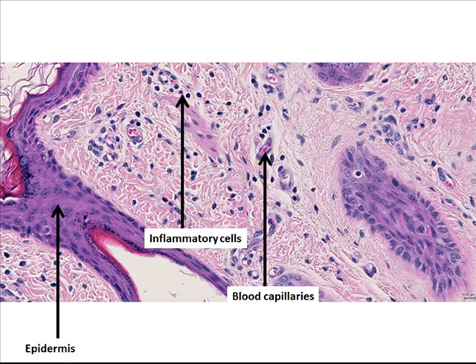And then in this final section here, again we're pointing out the epidermis to you here. Again it's a bit thicker in this particular section here. I also wanted to point out in this section of skin we're looking at here, it's a bit inflamed. This animal has an itchy skin, would have an itchy red kind of skin, and so what that means is that the individual blood capillaries become more obvious. So this arrow here is pointing out to you a small blood capillary with 3 or 4 individual red blood cells that you can actually see quite nicely sitting within that structure.